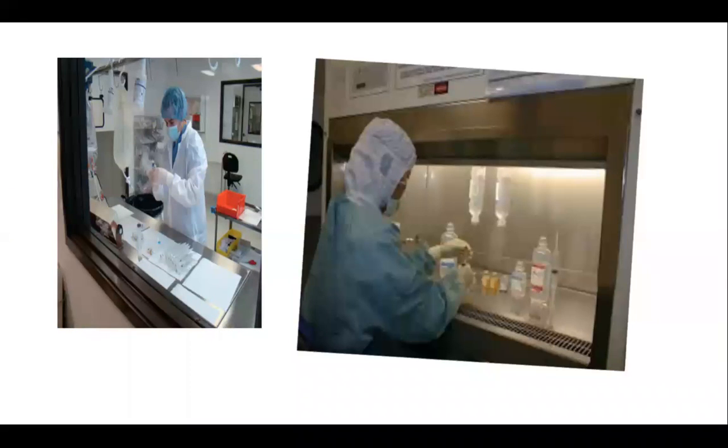Now you can see how they are filling those injectables, drips, larger volume injectables. Here you can see, and mostly they are wearing this type of clothes, dresses, PPE. These are the various types of dresses they have to wear before reconstituting the drugs for dispensing towards the various wards.